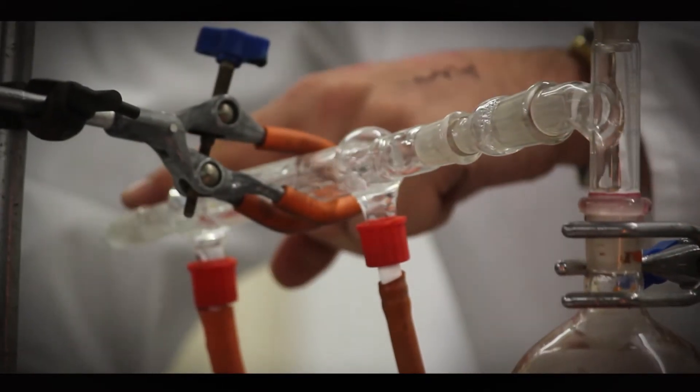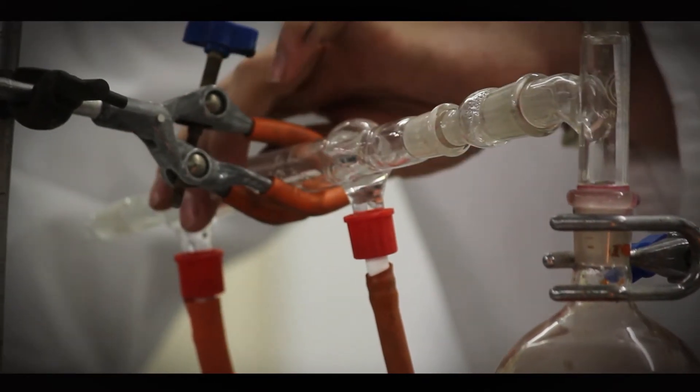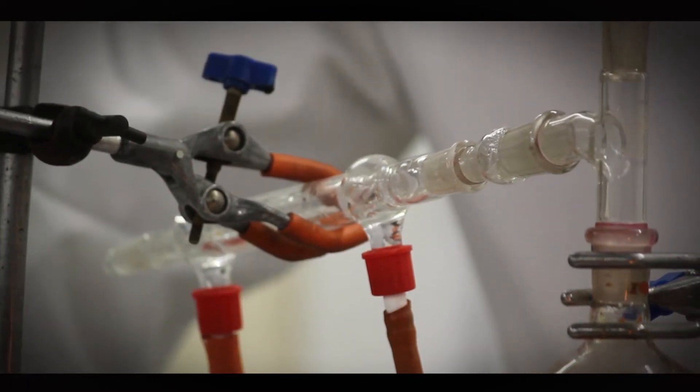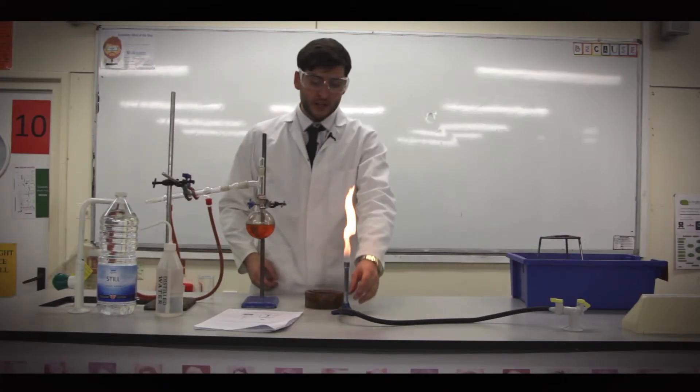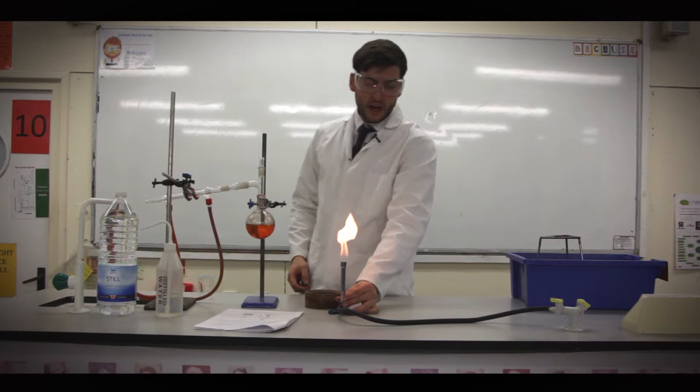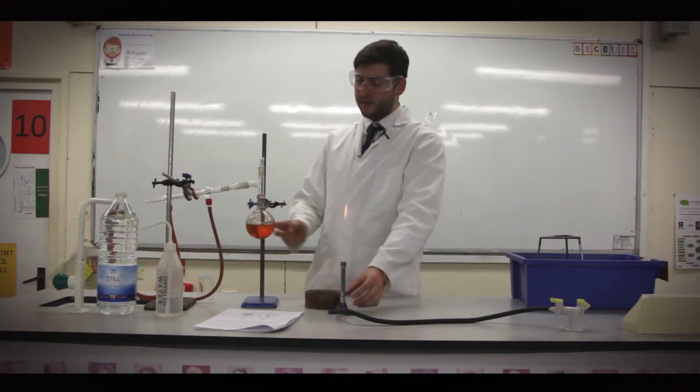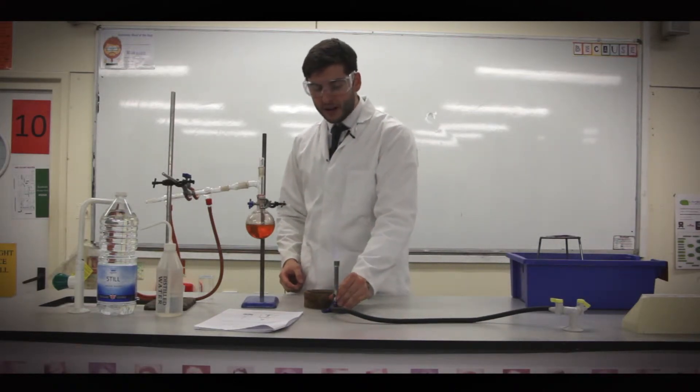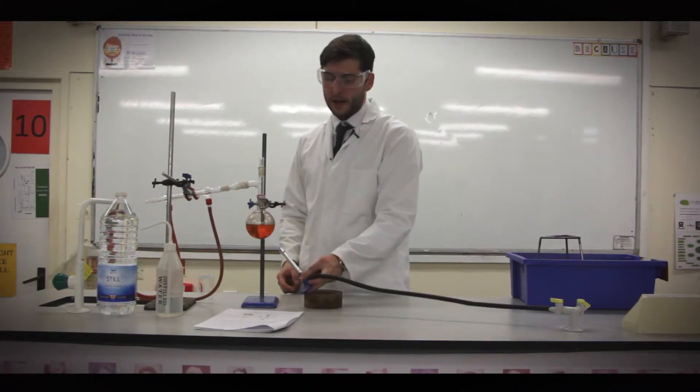You should see some water rise up. That is only, that's not coming into it, that's going around the outside. That's to make it cold. And all I'm going to do is I'm going to heat it up. Now unfortunately my gas tap is over there and my sink is over there, so I'm going to have to lift it up. And you heat it on a roaring flame.